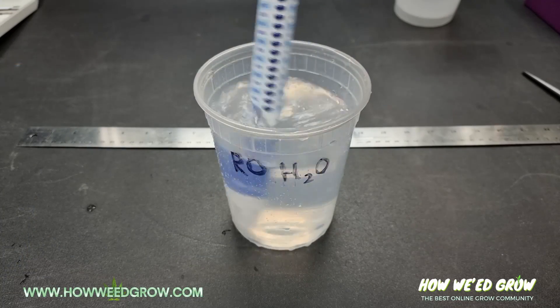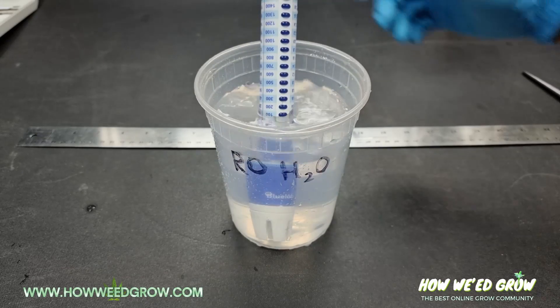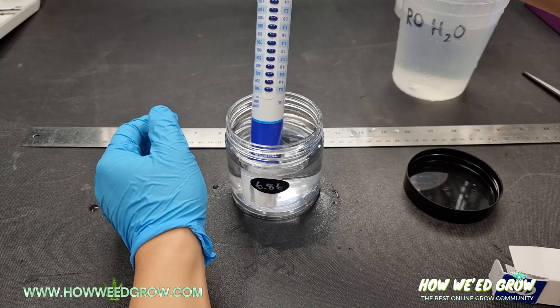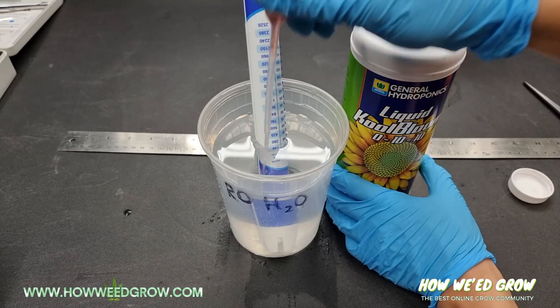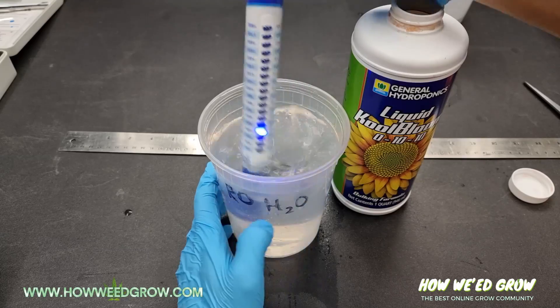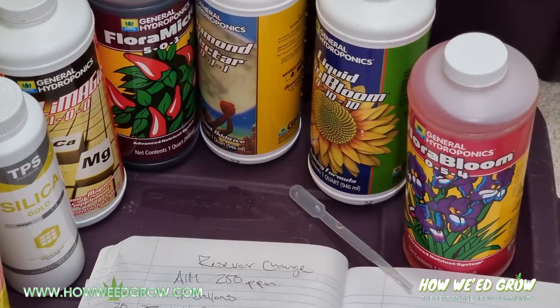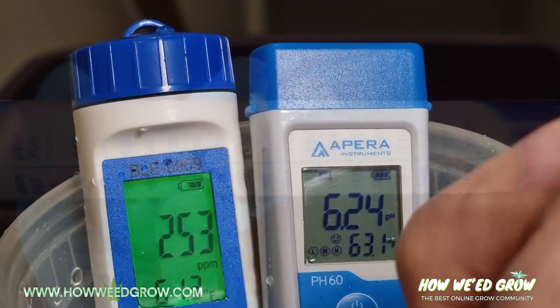Unless your PPM is over 100, this will continue to read nothing, as if it wasn't even in water. The first time I tested this in RO water, I thought it was defective, but it's simply because it wasn't over 100 PPM. When I'm mixing nutrients, I want to know the exact PPM I'm adding. In my hydro setup, I never go over 250 PPM, so this definitely didn't work for me.